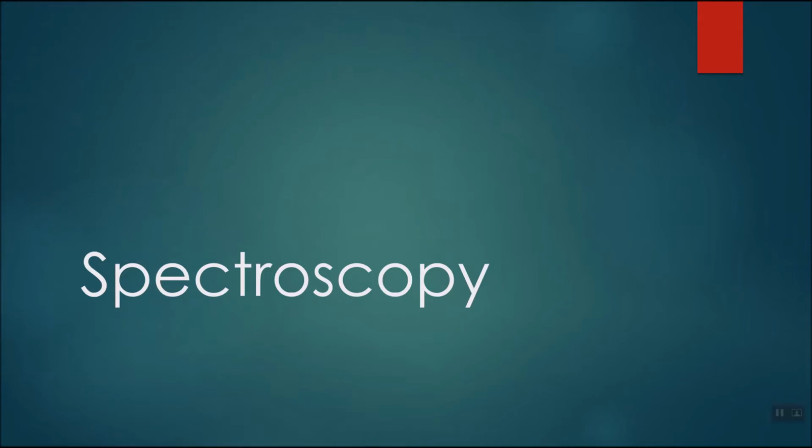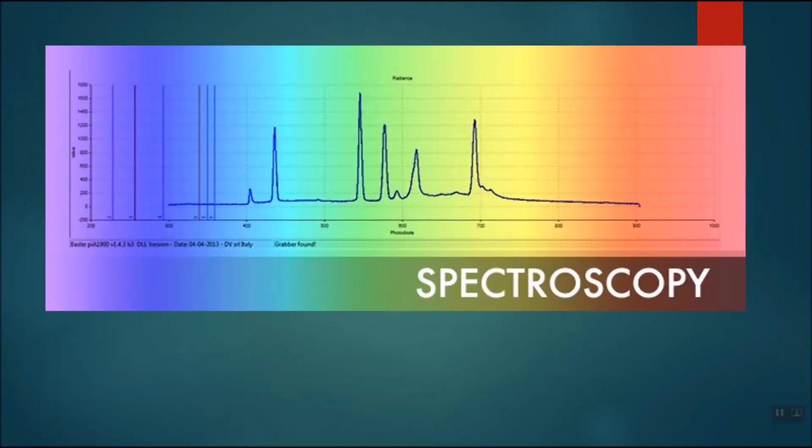You see, one of the things you must come to grips with is the fact that every element and every compound has its own particular light fingerprint. Just like every fingerprint is a little different, they can identify you by your fingerprint. In the same way, we can identify elements and compounds by the type of light that they emit. Every element and compound will emit its own particular type of light.